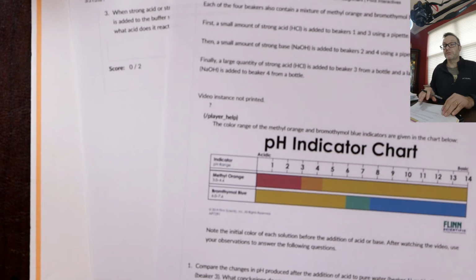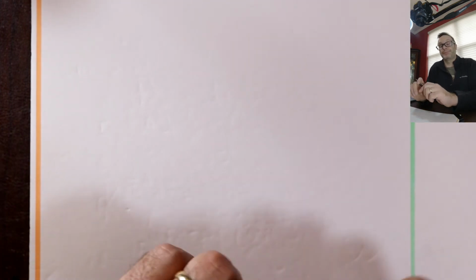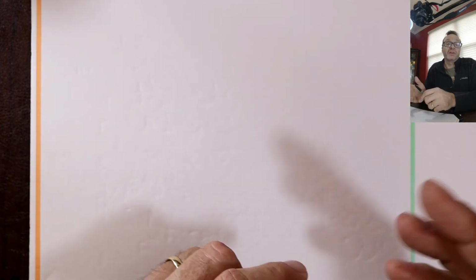Again, read the packets, if you haven't already, but make sure you understand acid-base equilibria 1 through 3. Make sure you understand the questions from the buffer packet regarding buffers. The acetate buffer and the carbonate buffer in the packet will be very, very key for this experiment.